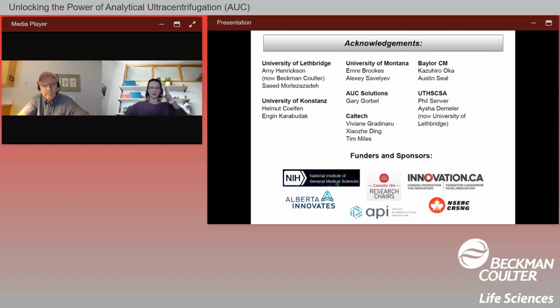Okay, thank you. And then along those lines, when you're doing multi-wavelength AUC, as you mentioned, you're able to look at different analytes within the sample. So if you're looking at protein-DNA interactions, you'd be able to tell what those are. With AUC, is it also able to look at interaction parameters and start to calculate K-off and KDs? Certainly, that's absolutely possible.